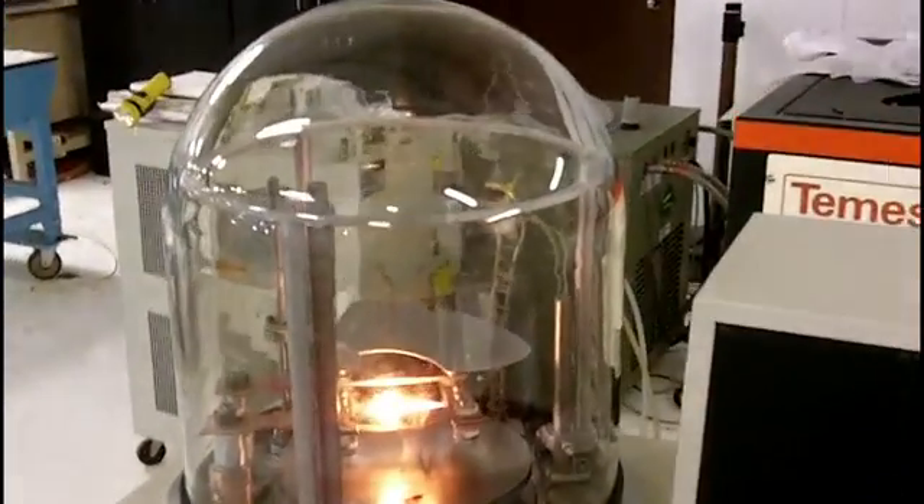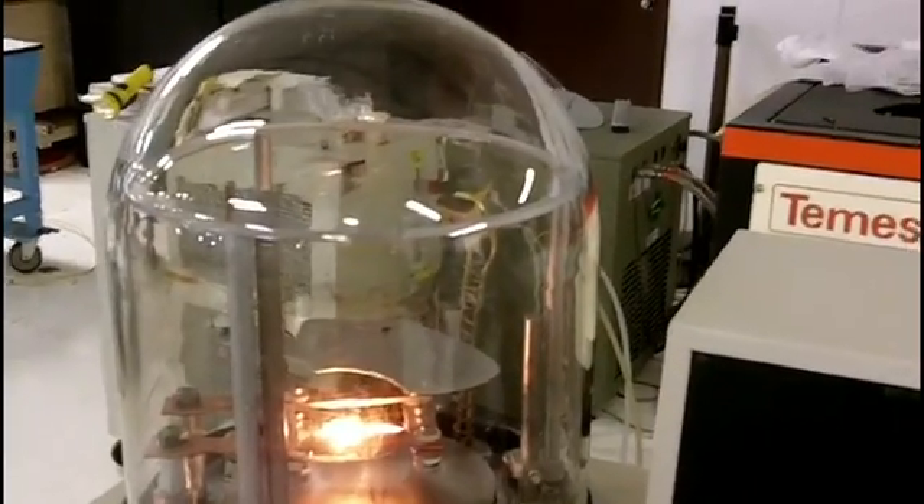And that concludes the test of the Edwards Auto 306.